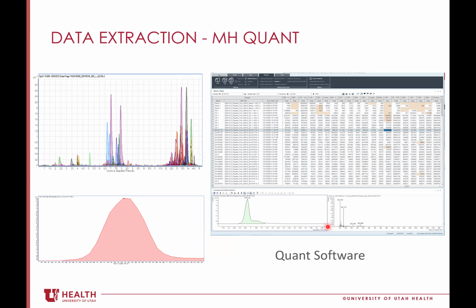Okay. On that scale, are the eicosanoids just totally not in range, or...? Oh no, it's a custom. Yeah, so that's certainly a very targeted approach. I don't know if Alan's on. Yeah, I'm here. How many microliters are we doing for eicosanoids in plasma? 20 microliters will suffice to get eicosanoids. It just takes a second. That needs to be a separate aliquot from your global lipidomics run.